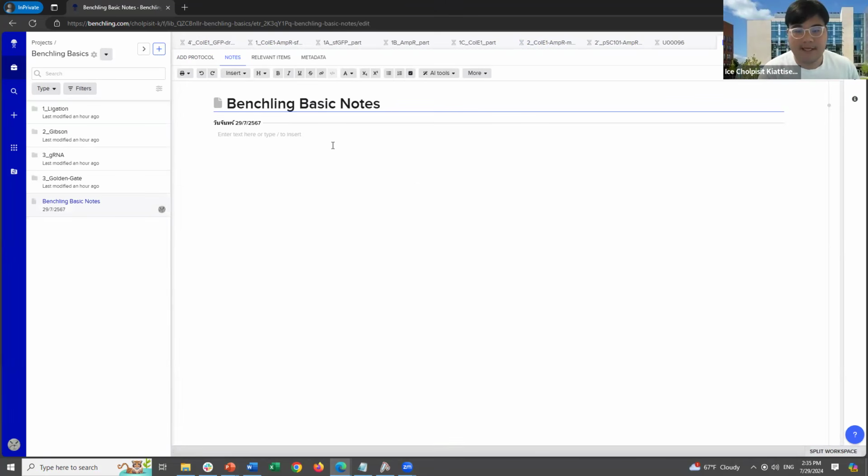So you can actually take some notes here as well. First, we're gonna try to do ligation of 3 pieces of DNA. And I actually pre-made these DNA already. So they're actually something that resemble the different parts that I showed you in the PowerPoint.